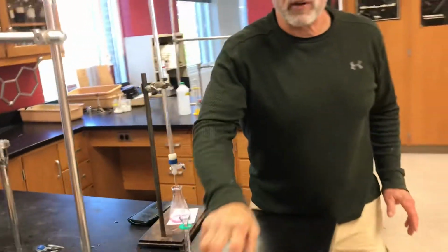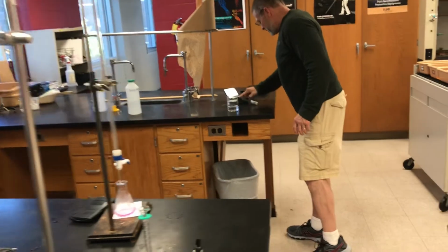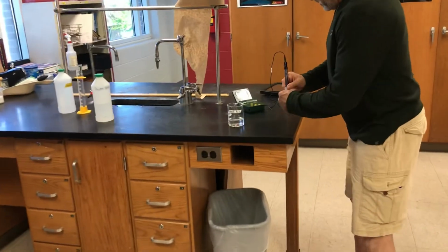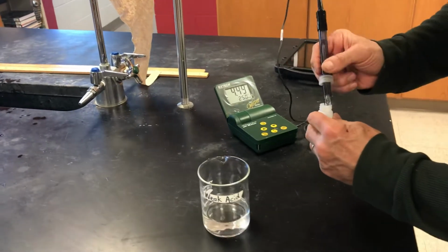Should be right reading. And now we're also going to get you the pH of our weak acid. So we pulled out and calibrated a pH meter.